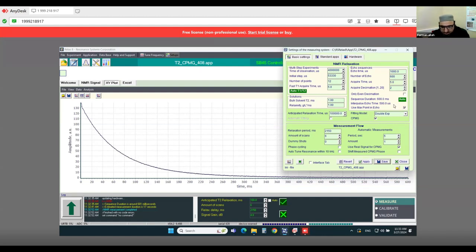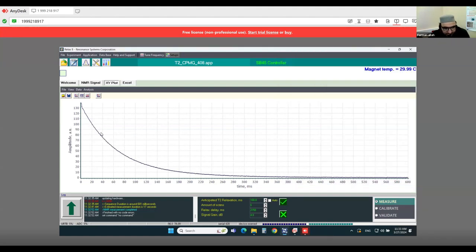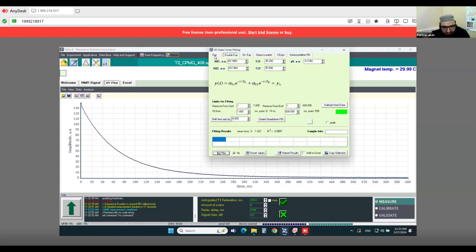First close this. And first, what happened, it is mono or bi. You can see here, I have told you before that we can also... I will point out here two problems.